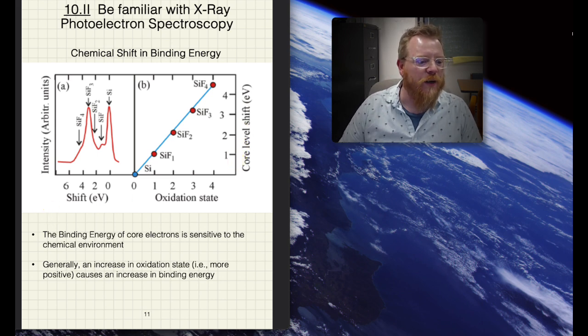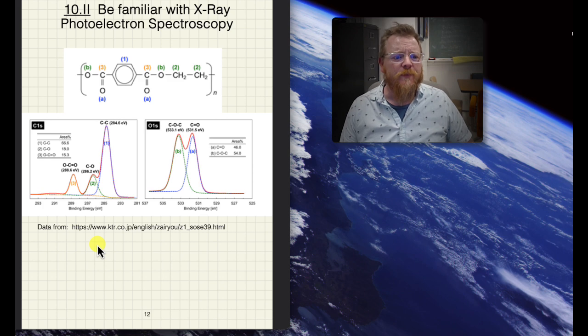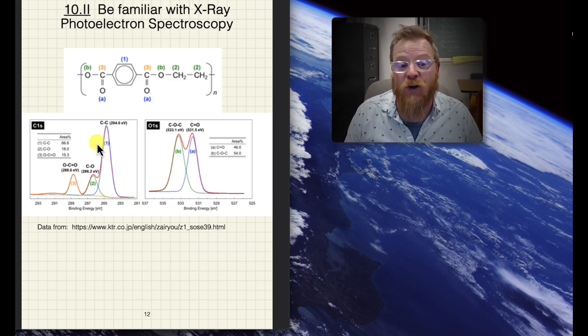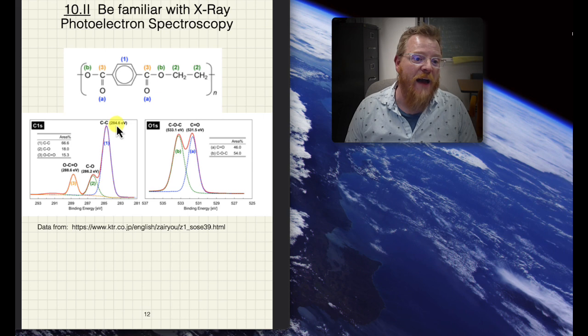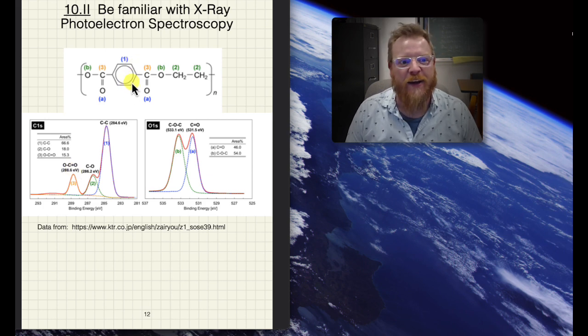And then the final thing that I want to talk about is what an organic molecule might look like in XPS. And so when we look at organics, we typically focus on the carbon and oxygen region, and we try to correlate them with each other. So looking at this polymer right here, we can see that there's a couple different types of oxygen as well as a couple different types of carbon. So for example, the carbon in the ring all shows up here at around 285, and that will have essentially a lower oxidation state than the oxidized carbon, right? Makes sense. And so you can see that oxidized carbon has a higher binding energy than the aliphatic carbon.